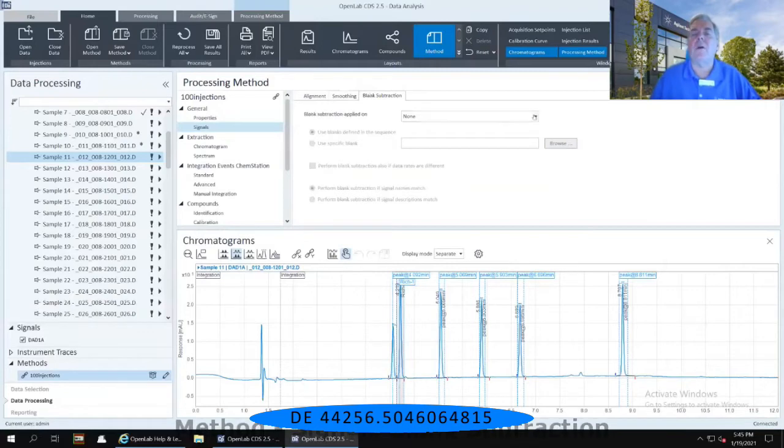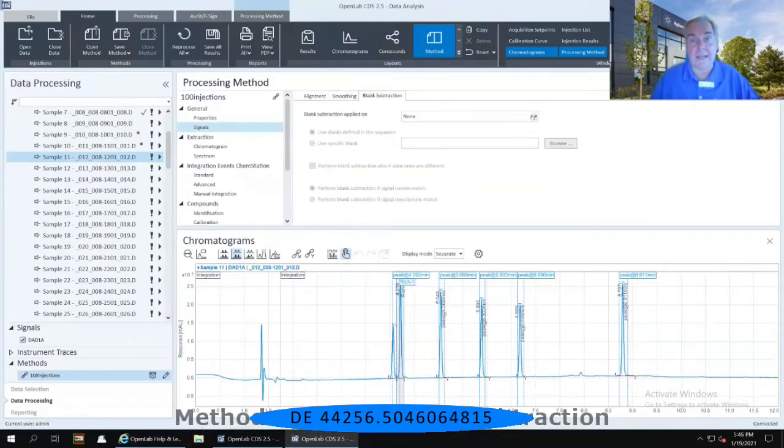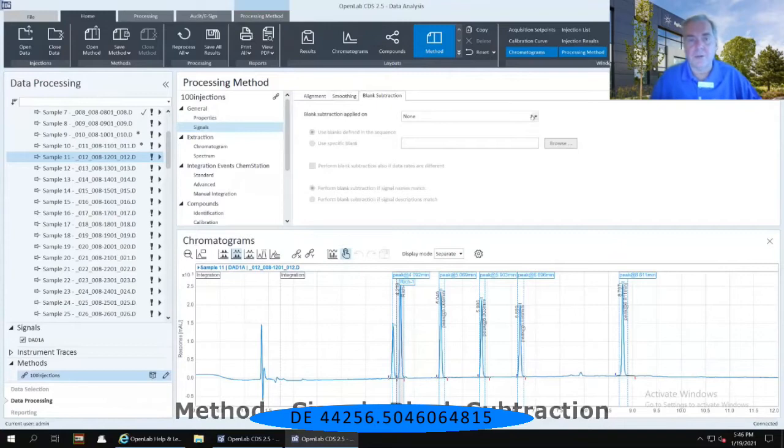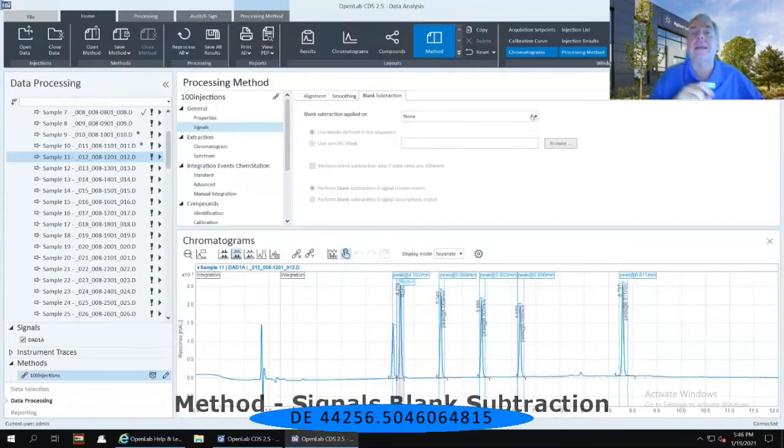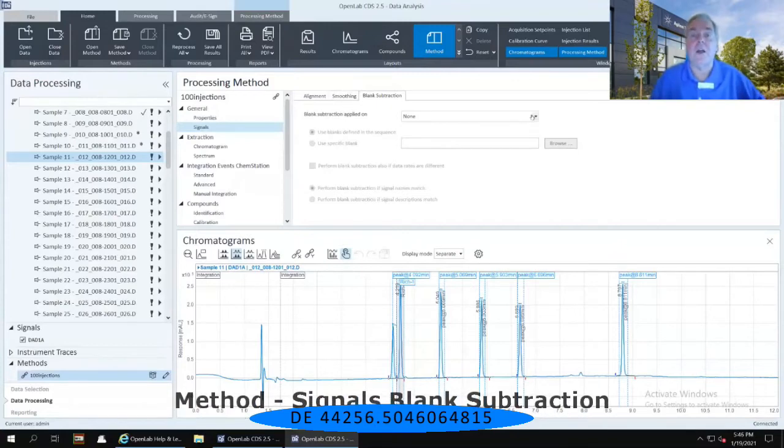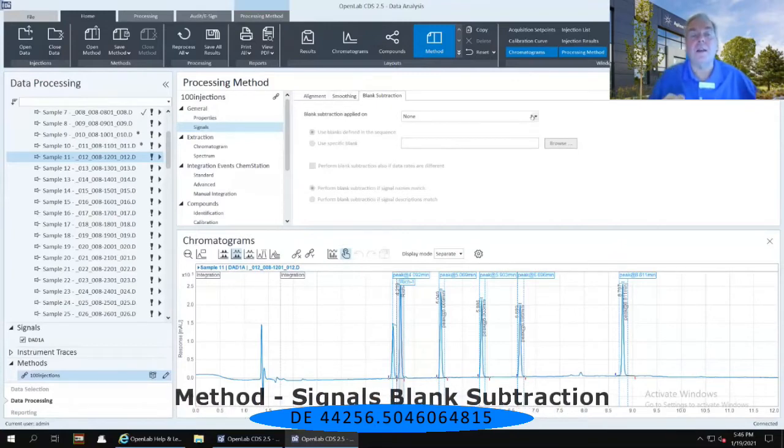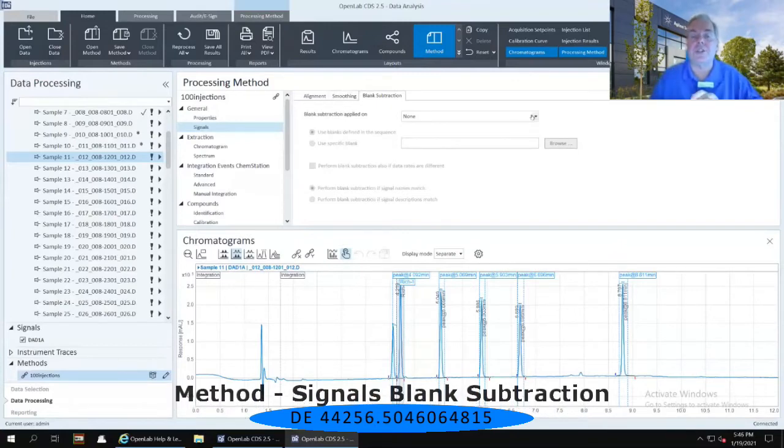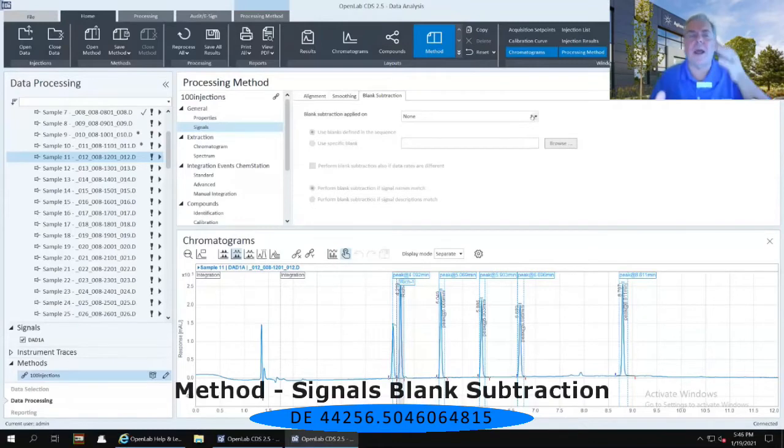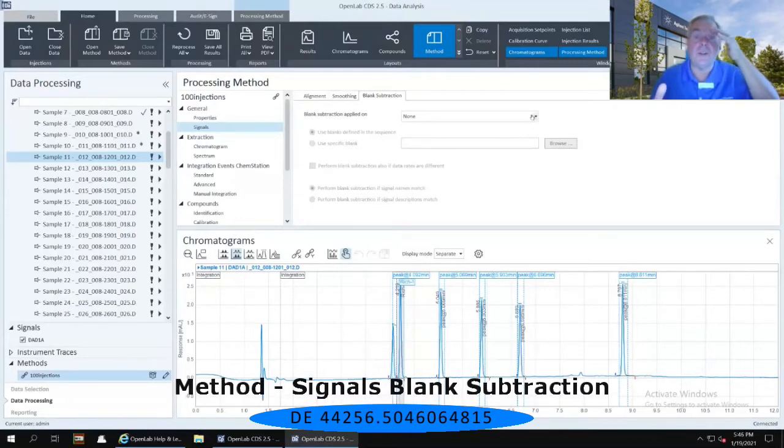Unlike our predecessor products of both ChemStation and EasyChrome, this allows you to do a blank subtraction on each one of these injections, and there are a variety of different ways you can do that.